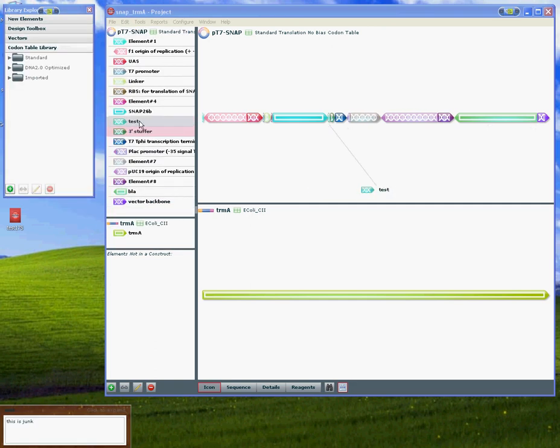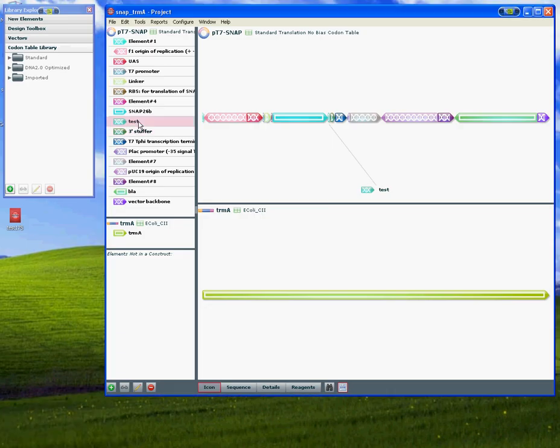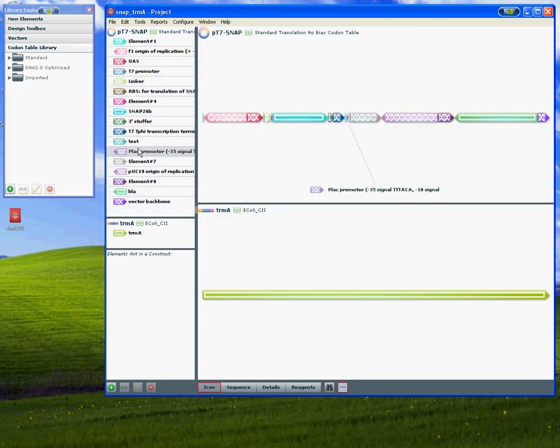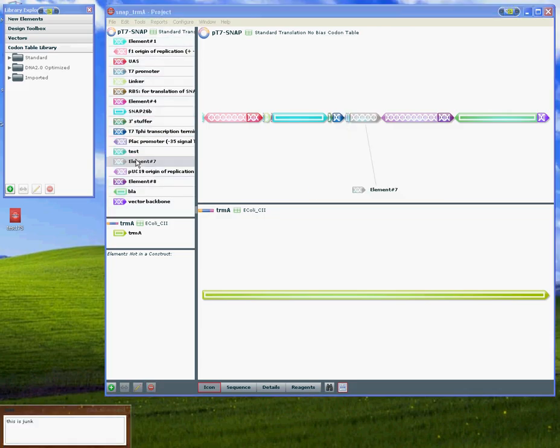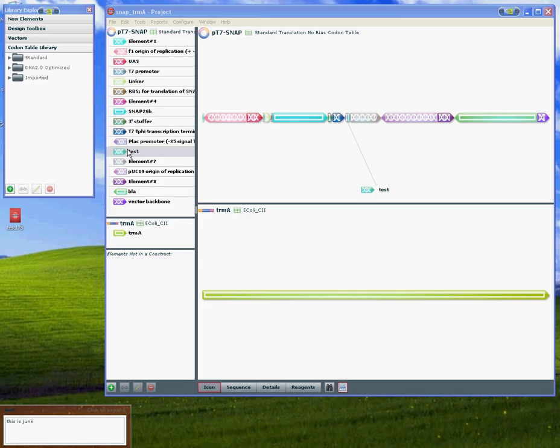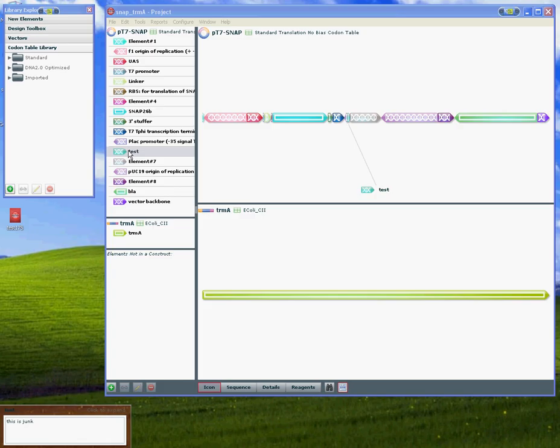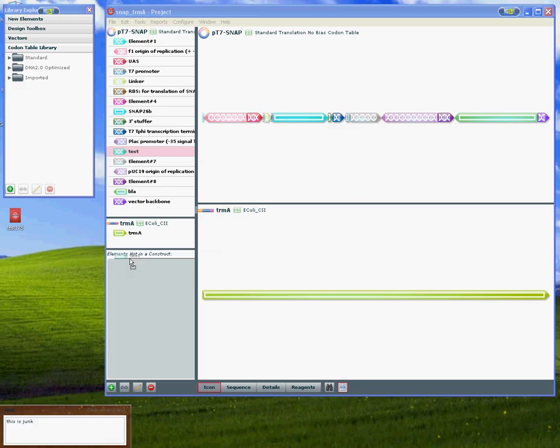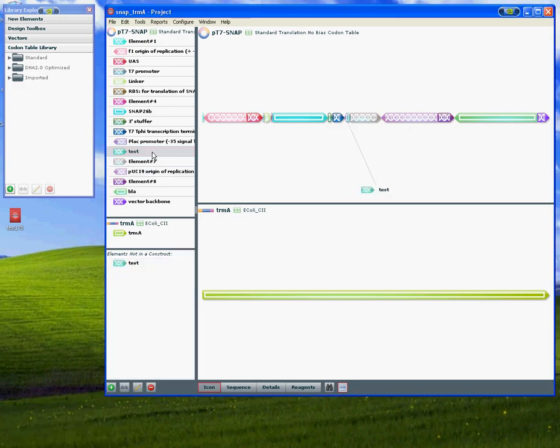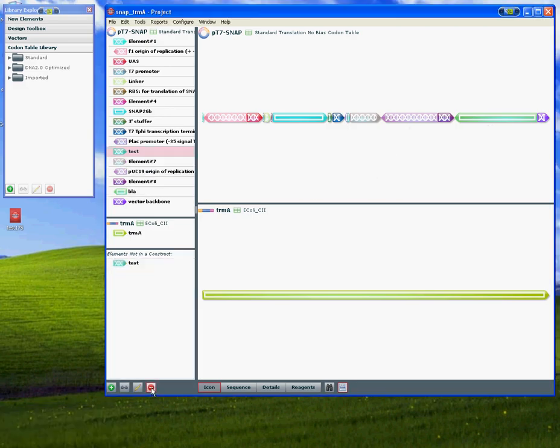The new element is now found here. You can drag it to any location you prefer, just by click and drag, or change the orientation. You can also remove elements not used in the construct and delete them from the overall sequence.